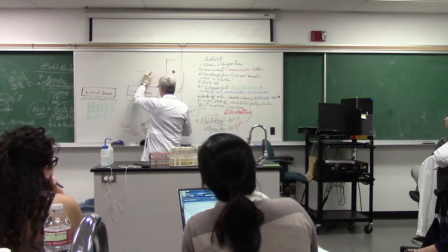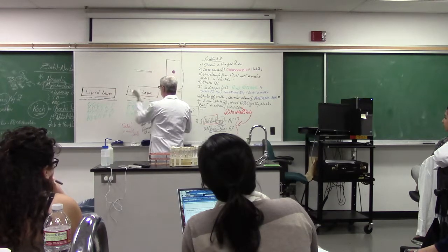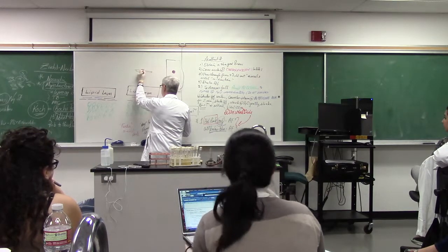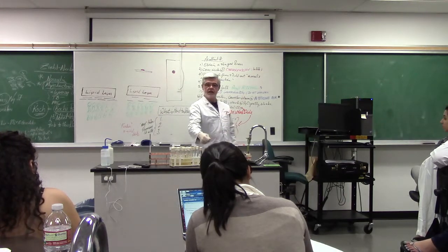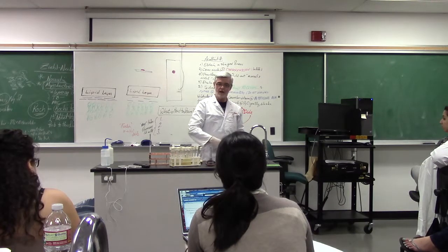Here's your slide, and you want this to make sort of a church dome bubble. You want that carbol fuchsin to be like a bubble here. And you're going to pass it through the flame and out. Through the flame and out.